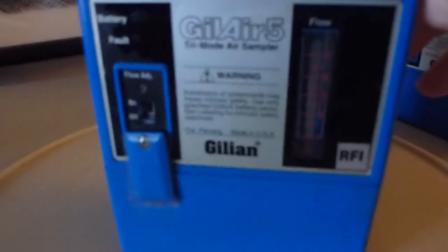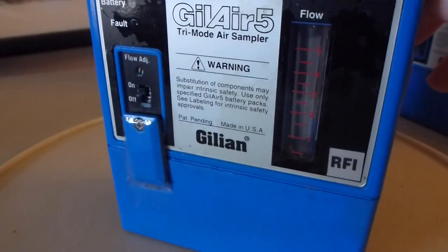Second one, I can turn it on. Gauge is working. It also has a serial number, and the LED is working.